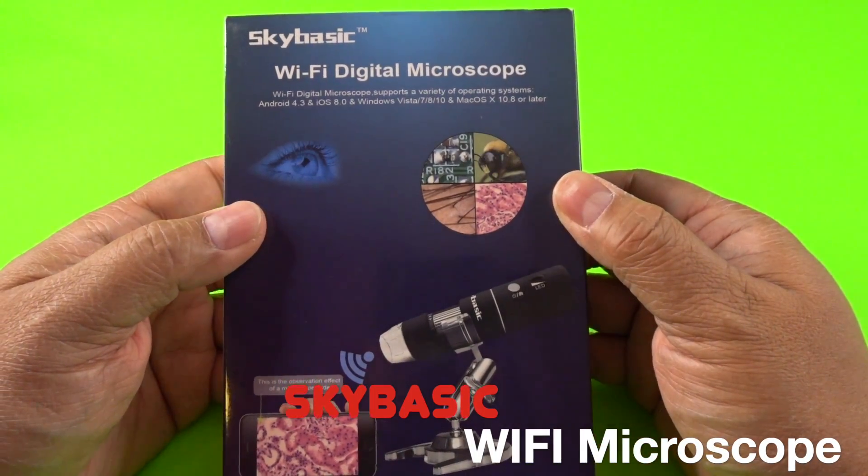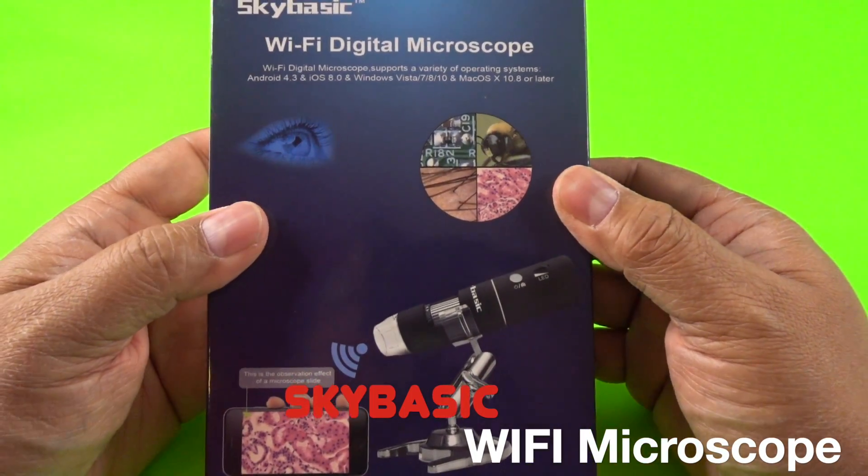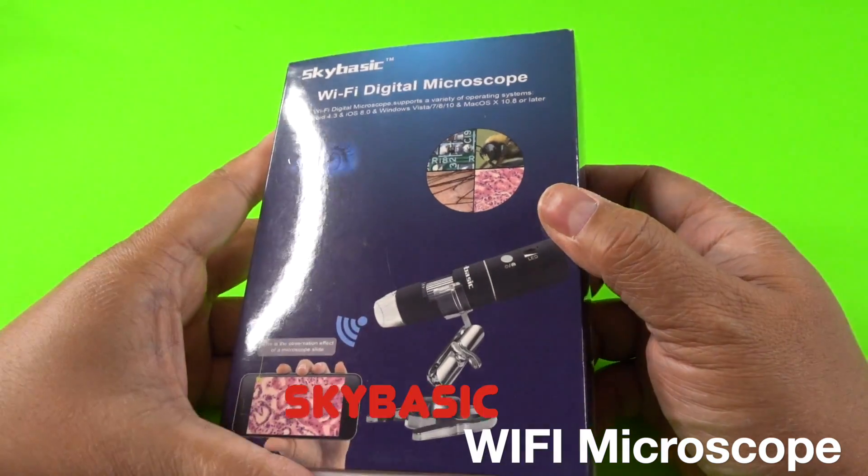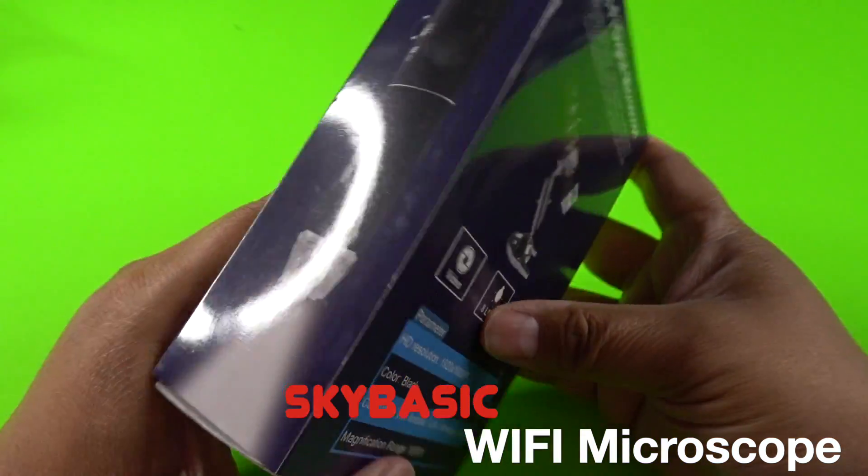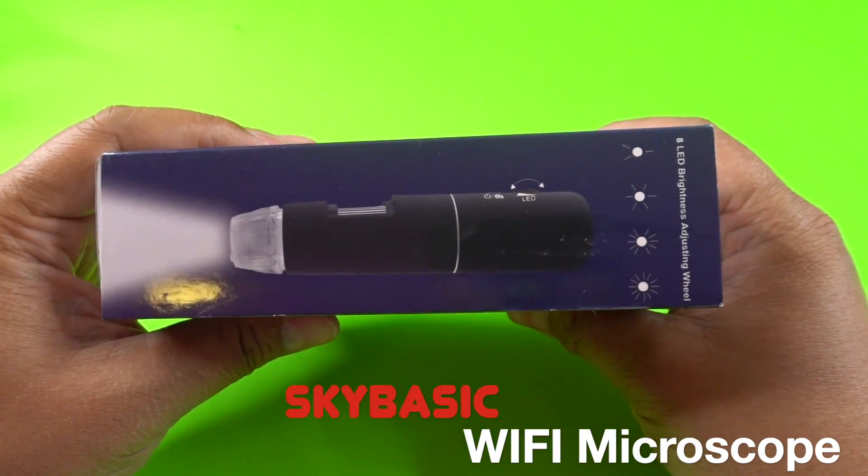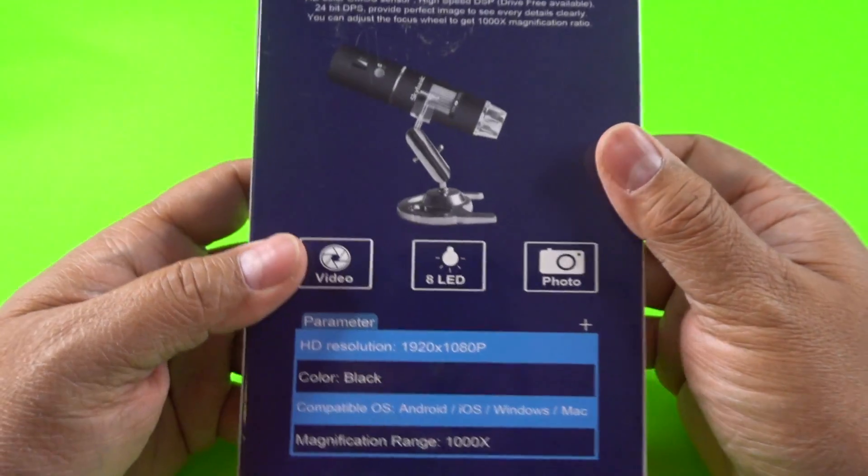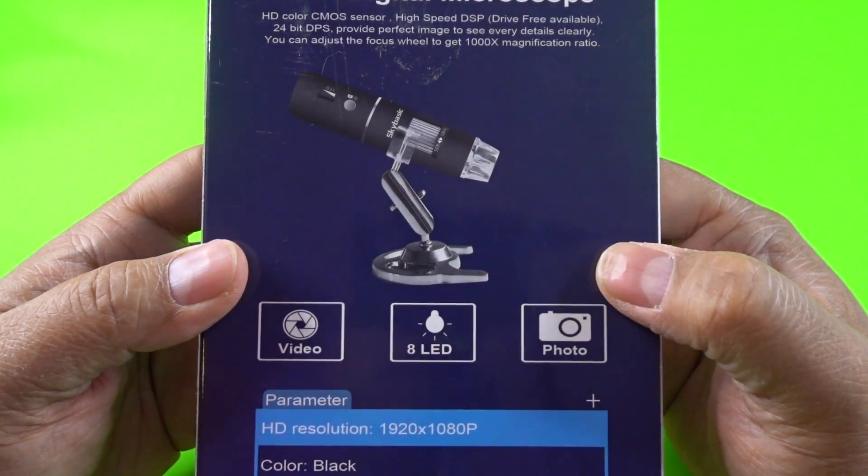Hi everyone. I'm here to show you the SkyBasic Wi-Fi digital microscope. Look how small this box is compared to traditional microscopes. This is nice and lightweight and portable. Wireless of course. And this is what it looks like.